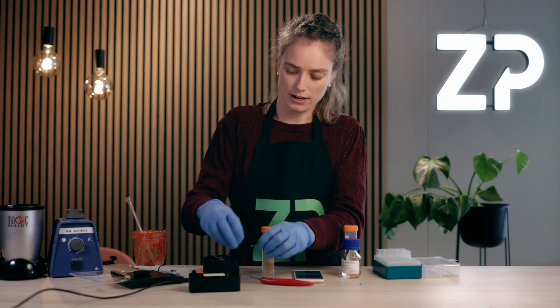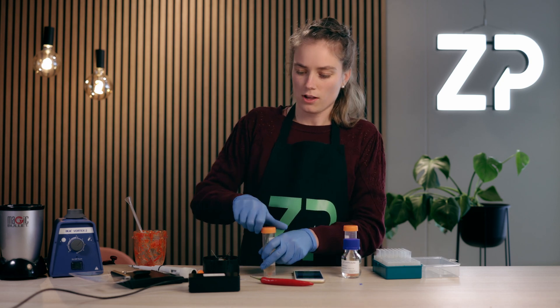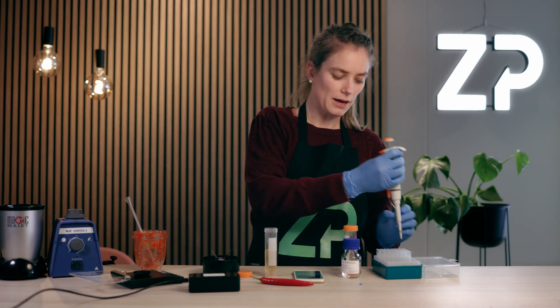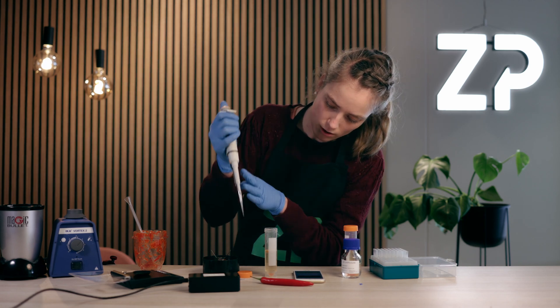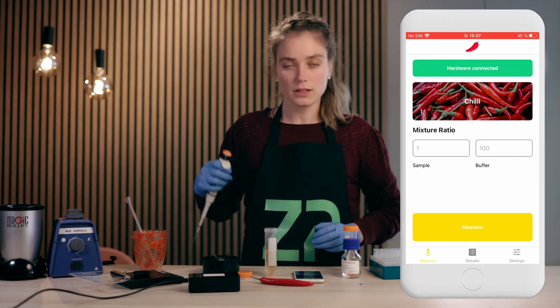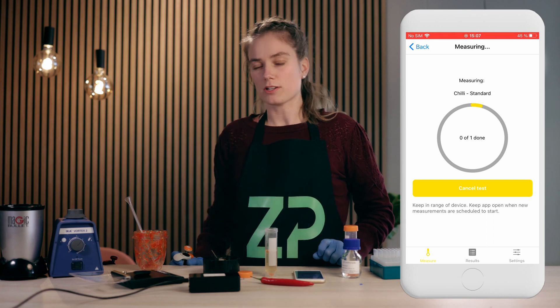I'll take the sensor and insert it into the FoodSense box, making sure not to touch the electrodes of the sensor or scratch the surface. Then I will pipette 50 microliters of this solution onto the sensor, covering all the electrodes. Then I will click measure on the FoodSense app and let it run for approximately a minute.